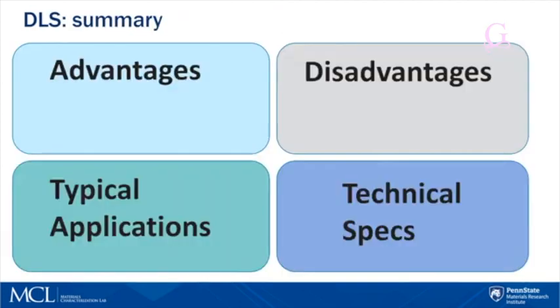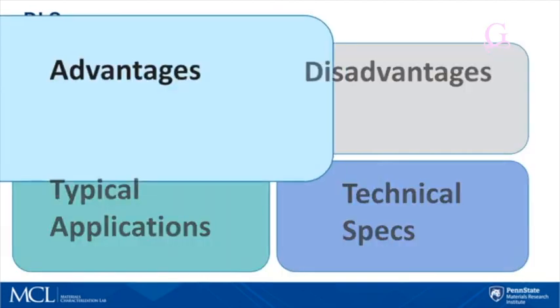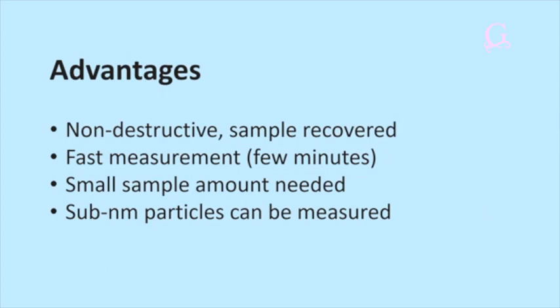In summary, DLS has the following advantages. It's a non-destructive technique and the sample can be recovered. The measurements are fast, a few minutes. Small sample amount needed, less than 1 milliliter, and we can measure very small particles.